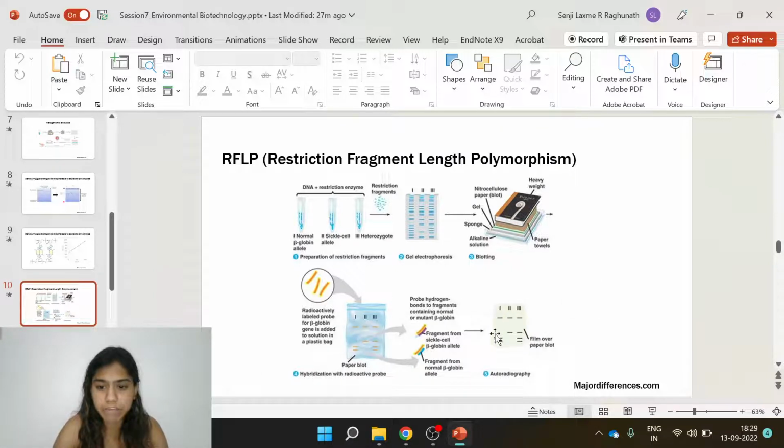So here, if we compare within our samples, we see that this particular sample has these two bands which are absent in the second lane, whereas all three bands are there in the third lane, which means that this one is a combination of the first and second one, and hence it's a heterozygote. Similarly, if in our samples of interest we have a particular community where we see such a combination of bands, then we can see that that particular microbe is a heterozygote carrying two different alleles. Let's say for the same nitrifying bacteria example, if we get this kind of pattern, we'll know that there are two different alleles responsible for nitrification, and this one is a heterozygote which carries both alleles. So we can compare within the samples as well.